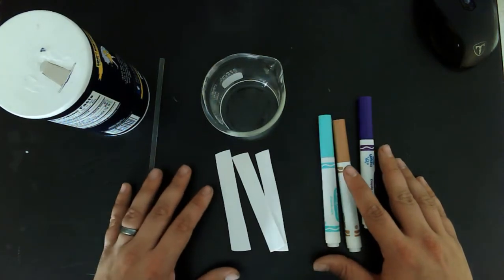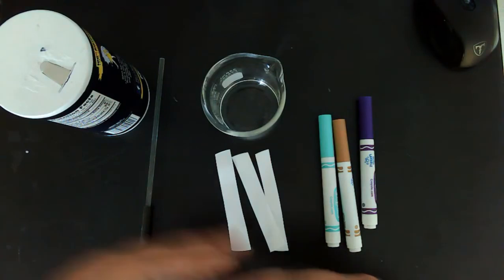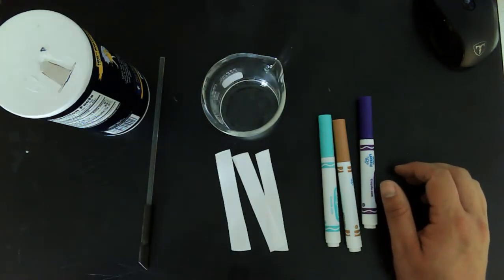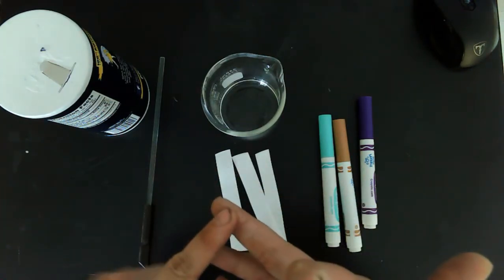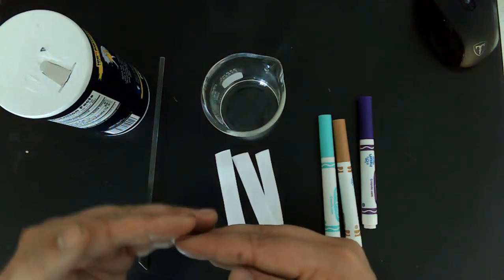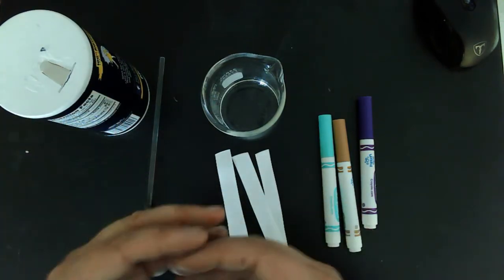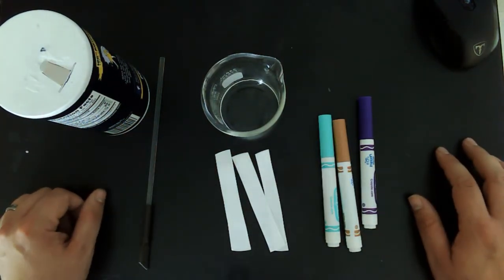Okay, now we're going to talk about what else you can do with chromatography. It's used in a lot of different places, especially in food sciences. Think about milk, which we talk about as a homogeneous mixture. You've got the protein, the sugars, the water, calcium and all the vitamins. With chromatography we can separate those molecules and tell, is there water in there? Is there sugar? And so on. We can see what is in that mixture. And hopefully we'll do it by the end of this video today.